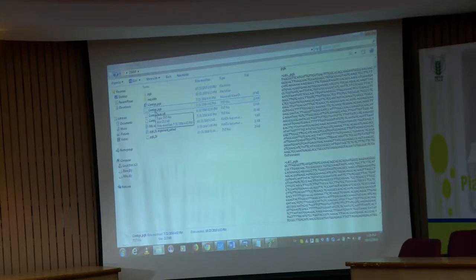In sequencing, some bases will be more in the beginning, some will start sequence earlier, some may start at a later stage. So, my purpose is to get a clear cut, bases 1 to 500 should be the same among all. Okay. So, what I will do, the raw sequence, I will make the Contig, make one file, Word file, convert it to text file, import it in this software.